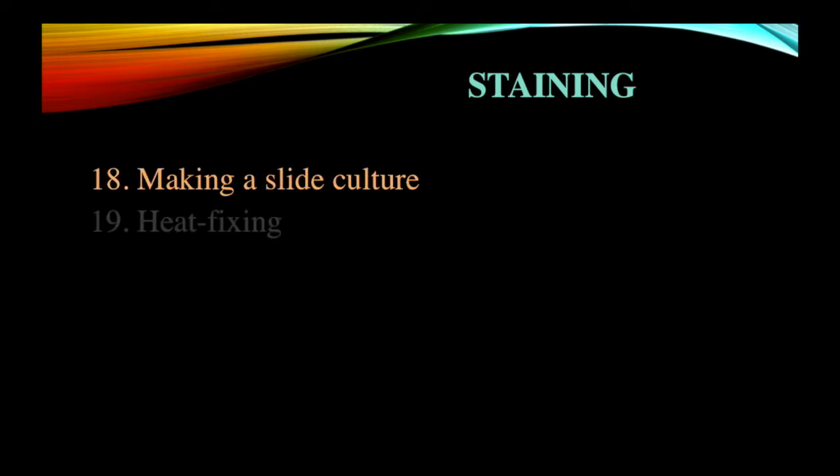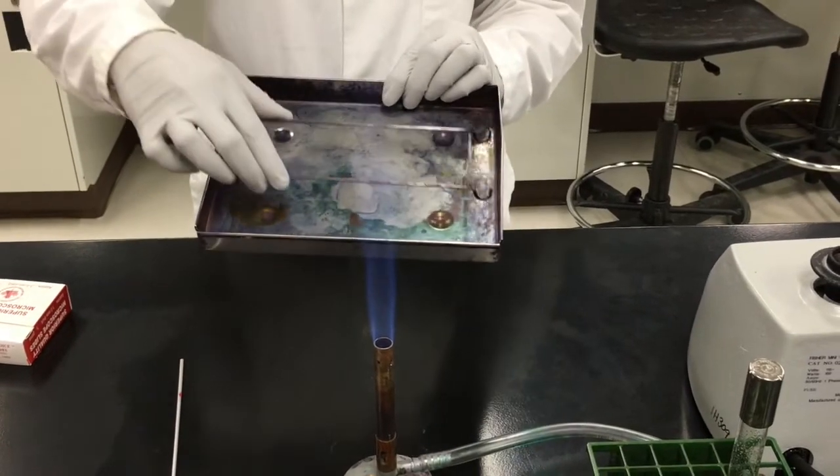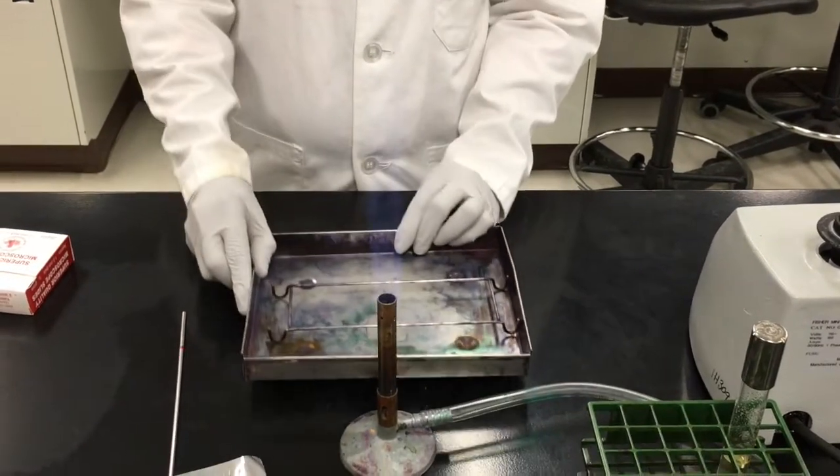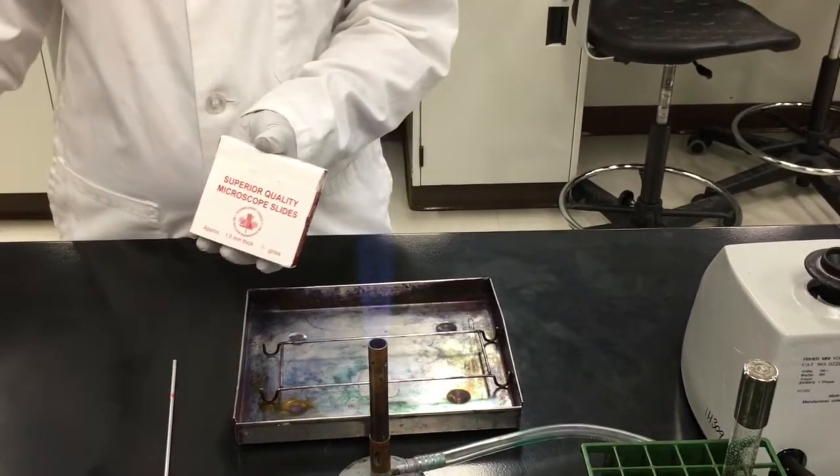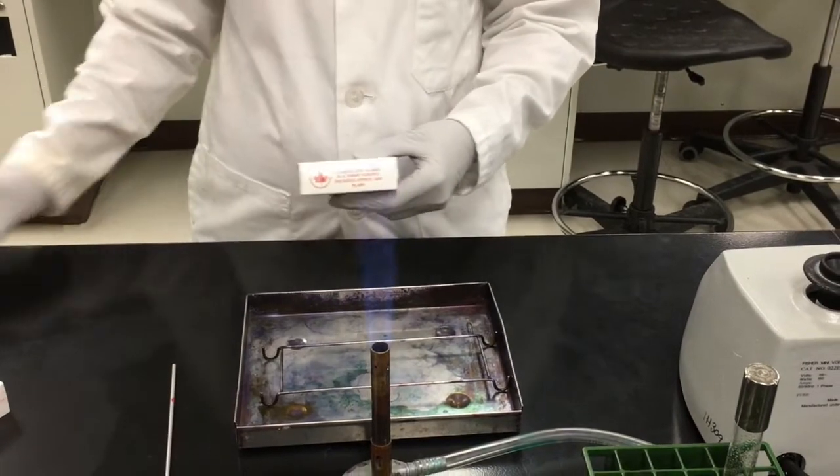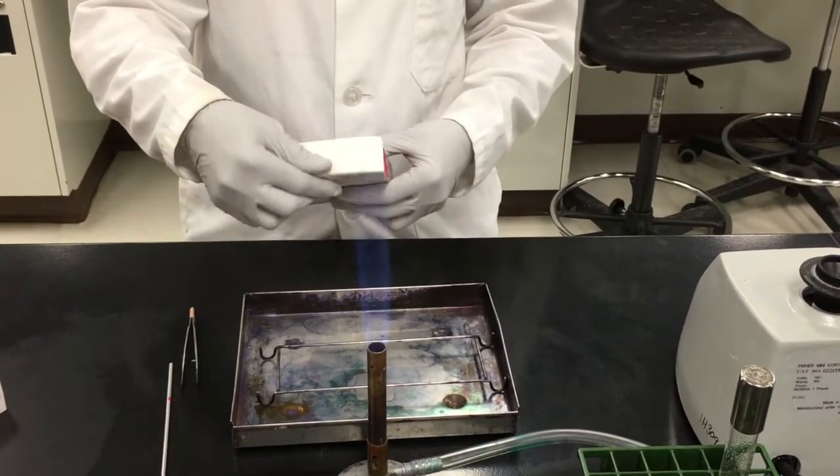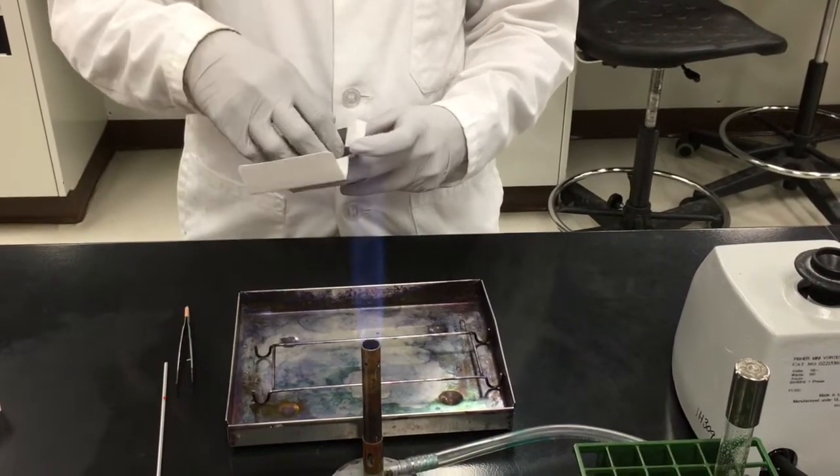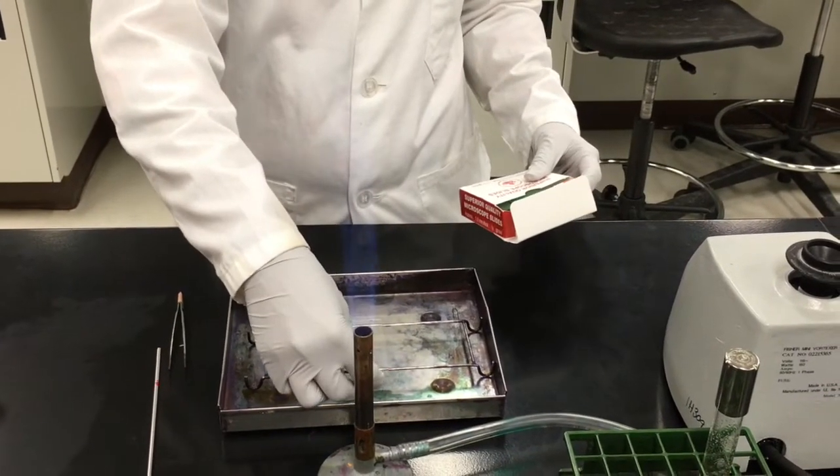The first step in the staining procedure is to make a slide culture. In order to do this, take out your staining tray with the insertable rack, place it on your bench top. Locate the box of the clean glass slides as well as a box of cover slips. Tweezers will be used to manipulate the slide during the staining procedure. Place a clean glass slide on top of the rack inside of your tray.